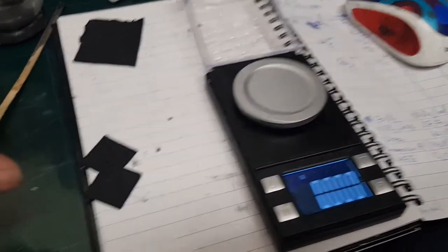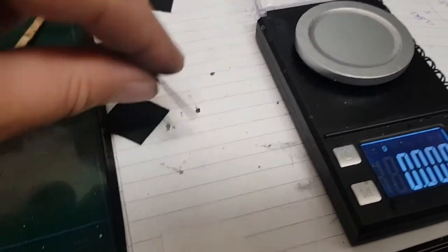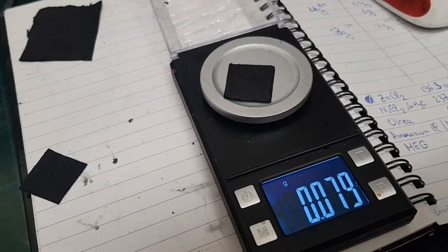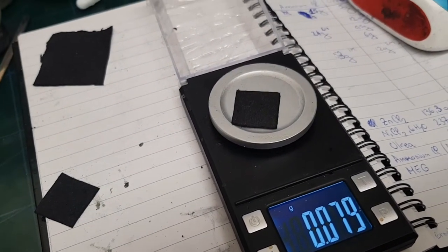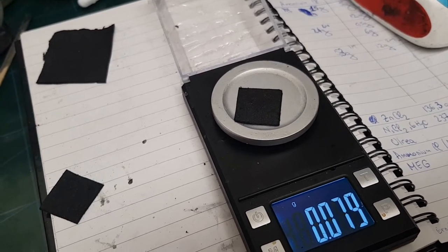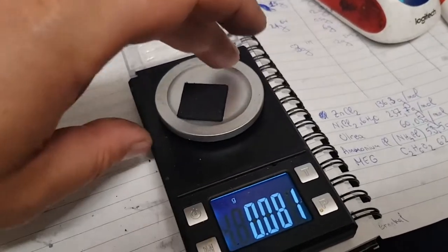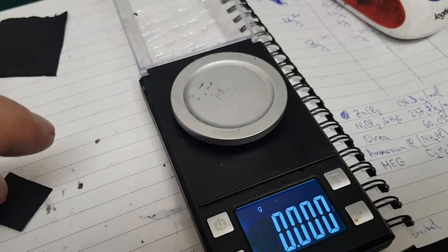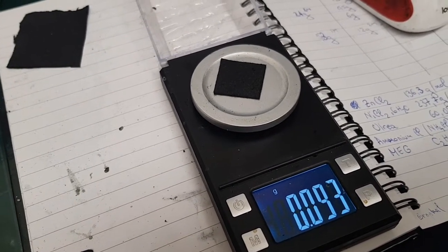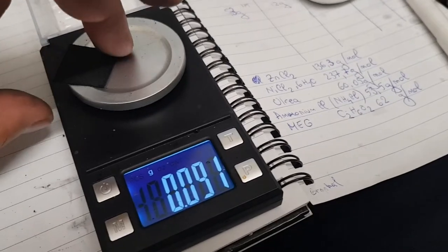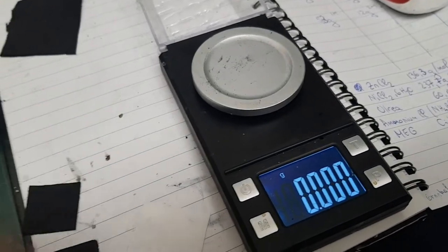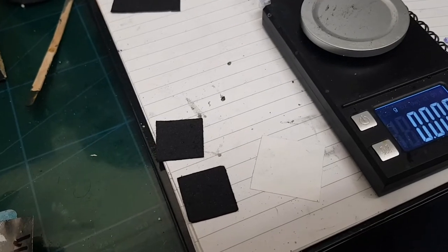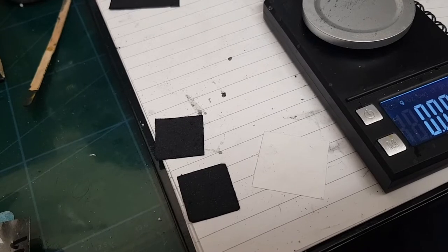Two small squares cut: one is 0.079 grams with the binder, so I'm presuming somewhere around 0.07 grams of active material - it's sacrificial active material. The other one is 0.09 grams.